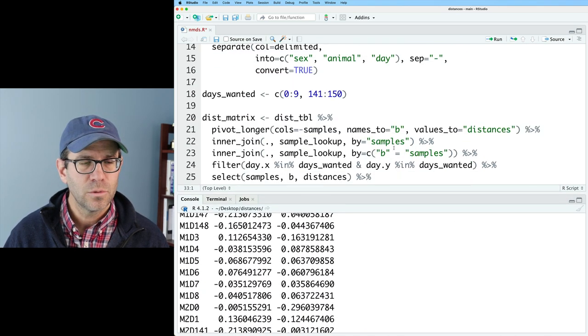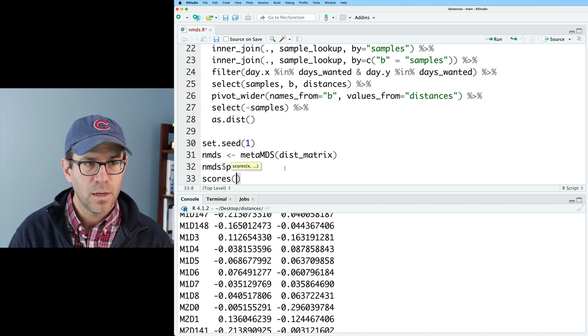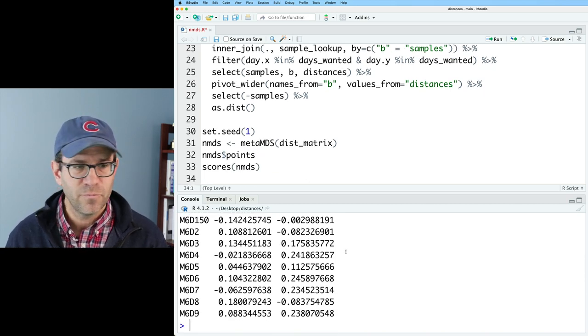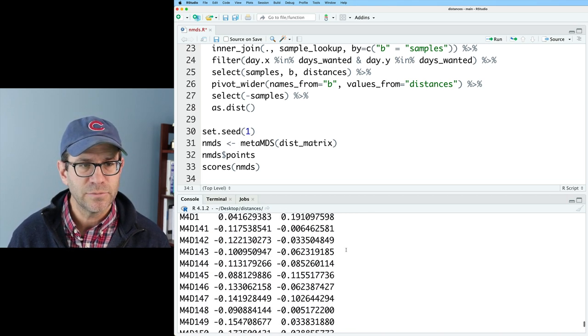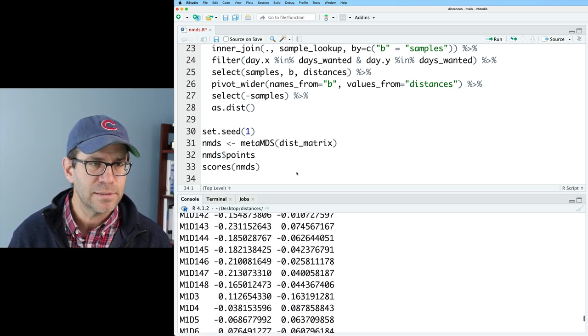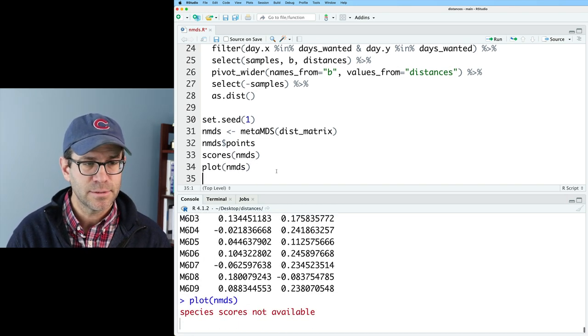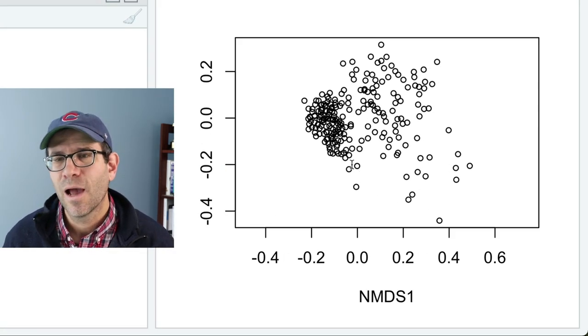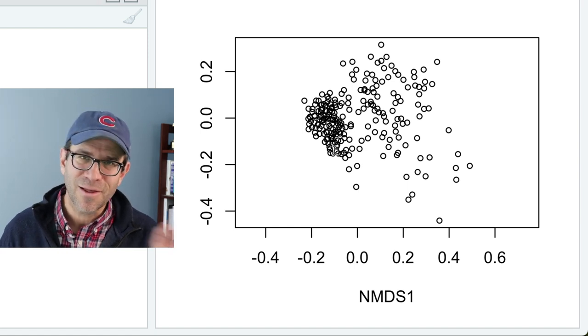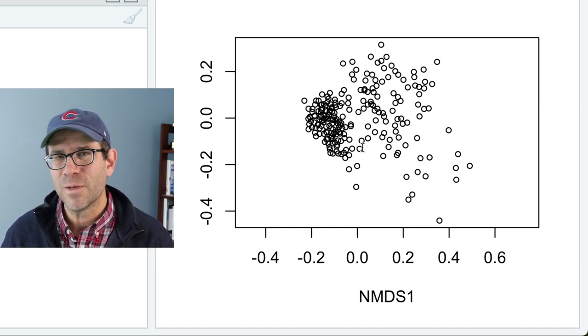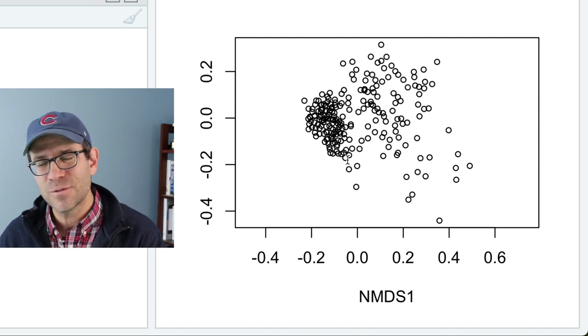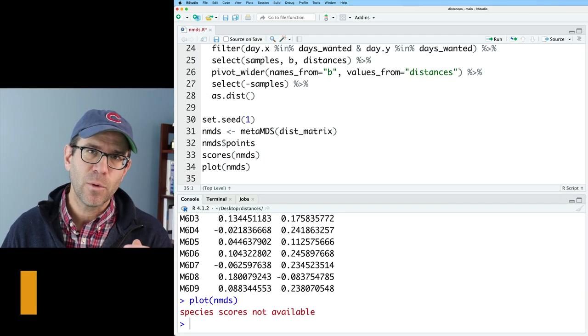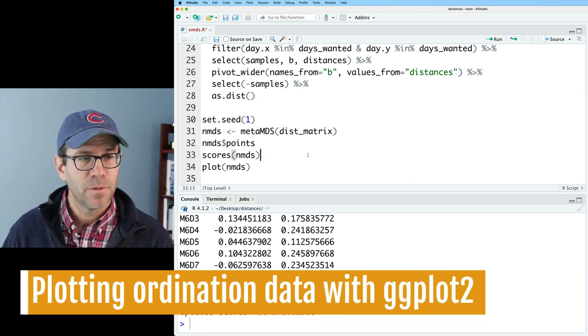There's also a function that you could use called scores NMDS, and this is a function from vegan that gives you the positions of all the points in the two different axes. We could also do plot NMDS, and this will then give you the ordination in base R graphics, kind of like what we saw the other day when we did this with PCOA. So what I want to do is instead of using base R to visualize the data, let's see how we go ahead and make this using ggplot2.